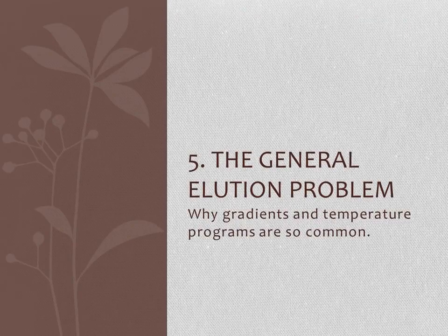Cool. So a last few comments here. The general elution problem.